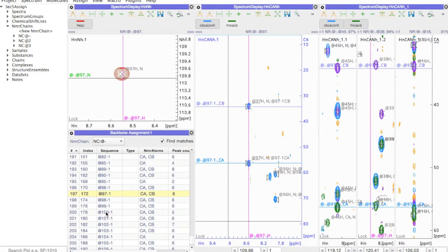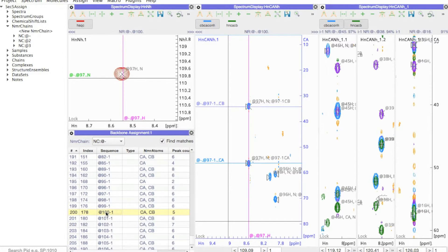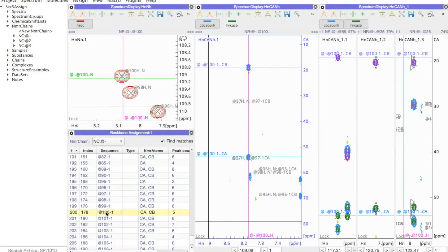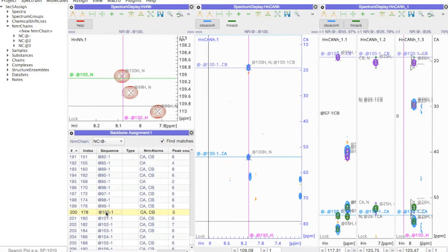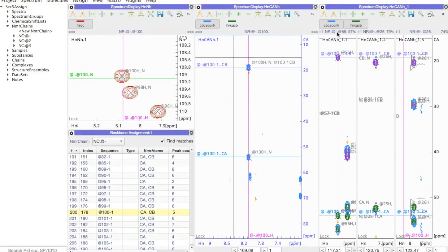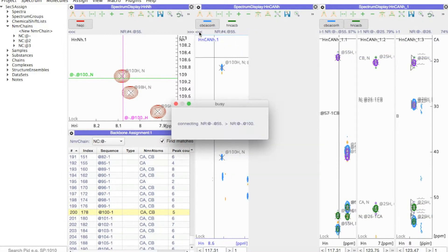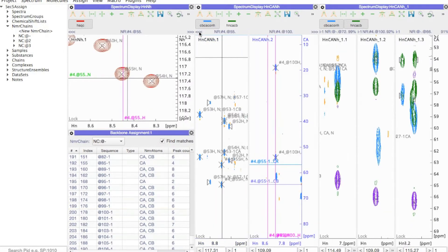If I double-click on a residue in my table, the spectra automatically navigate to those positions and here I found a match. I can then link these two residues simply by dragging the strip across.